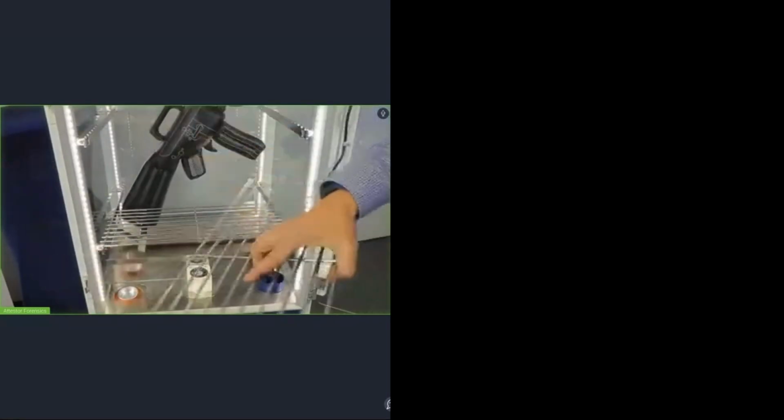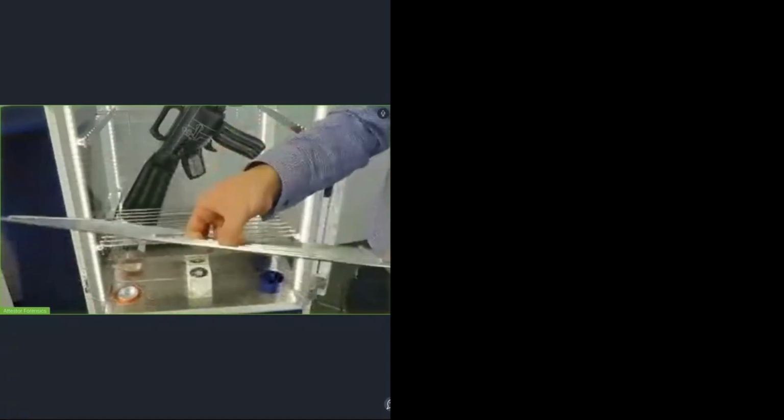So if I look into the actual cabinet, this is my grills. They're made from stainless steel and not typical barbecue shelves where you would have lots of cross poles, because for cleaning that's a nightmare. So we get them actually made especially for us with only 3 of those crossbars. And then on the sides, these are the side support rails, which you can easily take off. So in the end, when you clean it, that's a smooth surface.